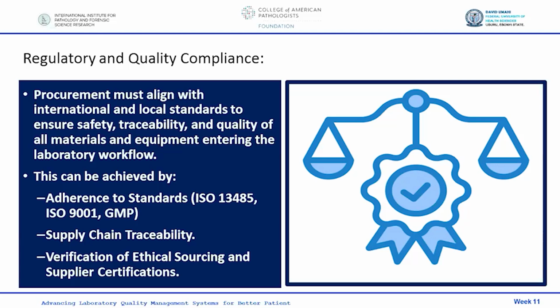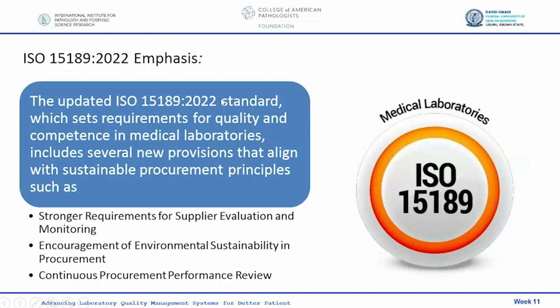Now, what is the emphasis of ISO on quality and regulatory compliance? The updated ISO 15189:2022 standard, which sets requirements for quality and competence in medical labs, includes several new provisions that align with sustainable procurement principles.